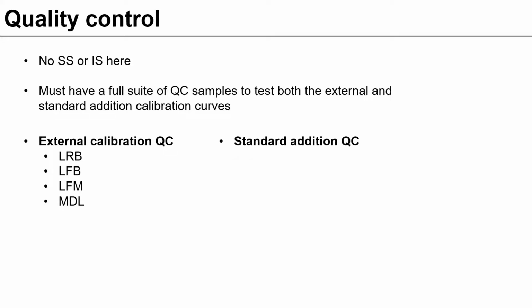So can we run an LRB for our standard addition curve? Kind of. Our LRB is just going to be our diluted sample, so it's going to be that 0 calibration curve point, essentially. Can we run an LFB? Kind of.